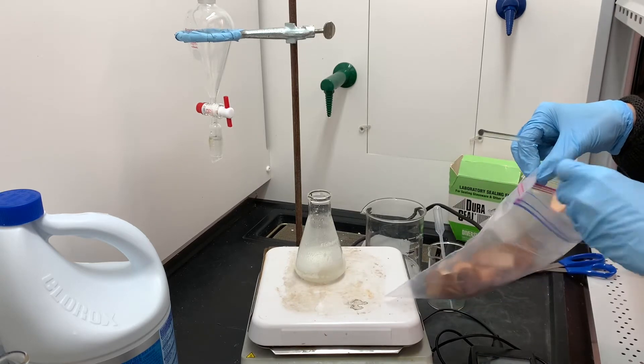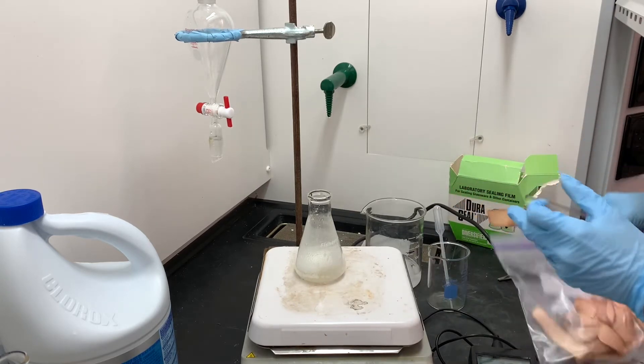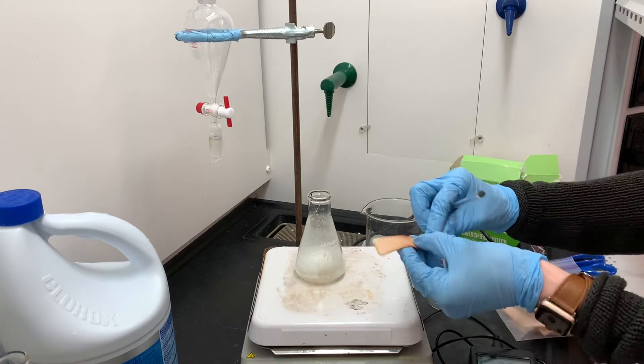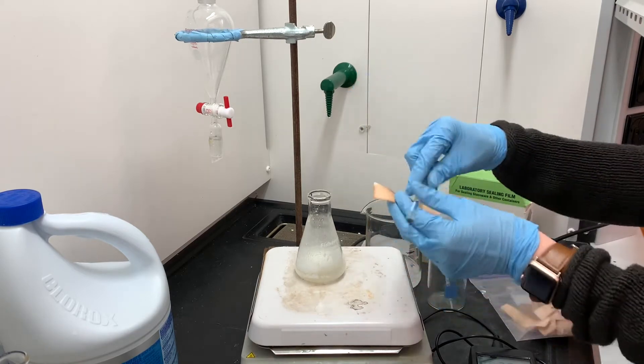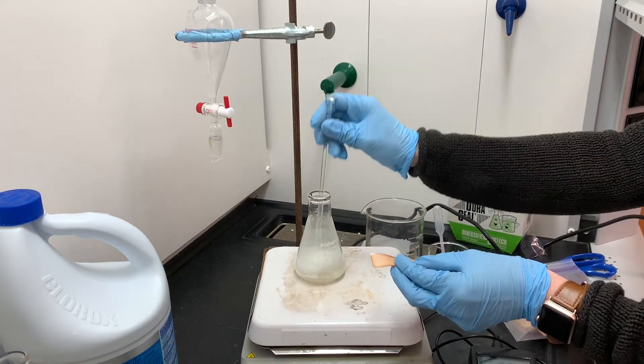I'm just going to be testing a little bit of the solution. If we have excess bleach present, I'm going to get a really dark blue, kind of black color on the starch iodide paper.